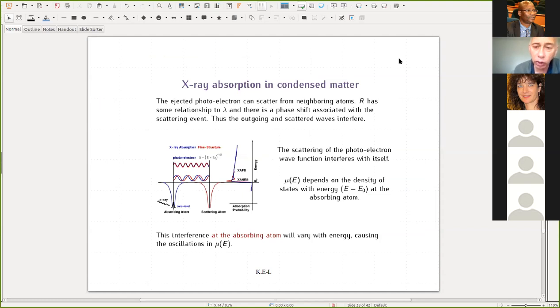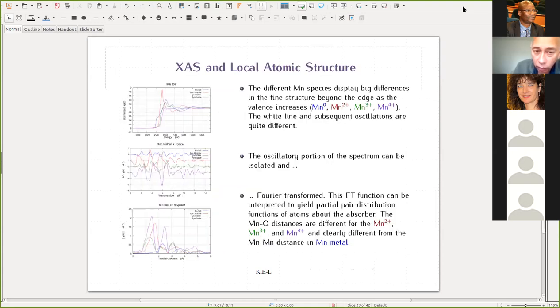So now I'm doing everything in a very superficial way, and I'm simply pointing out what's available, and you can pursue those paths to learn more. So in this case, XAFS is next. I think I have another view graph in the next one. Let me just double check before, right.